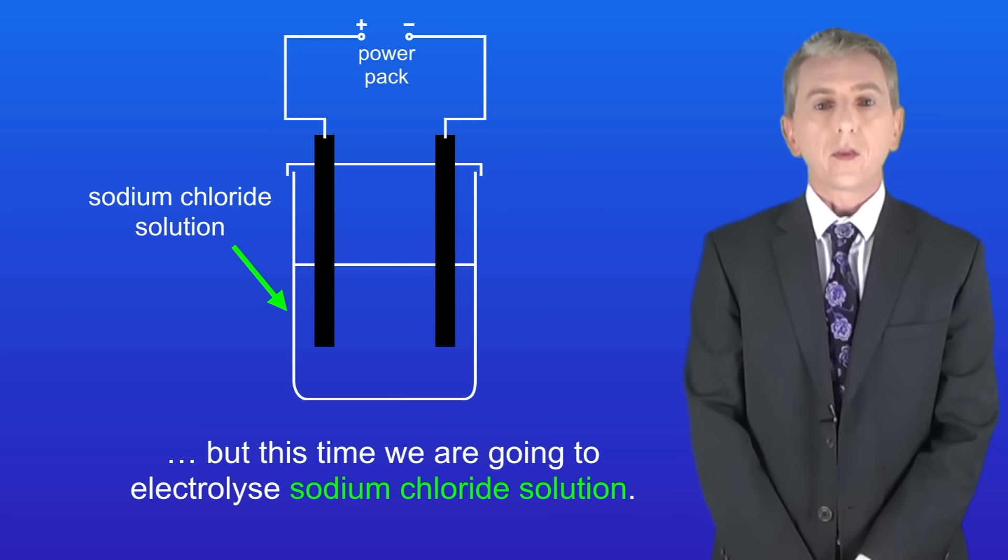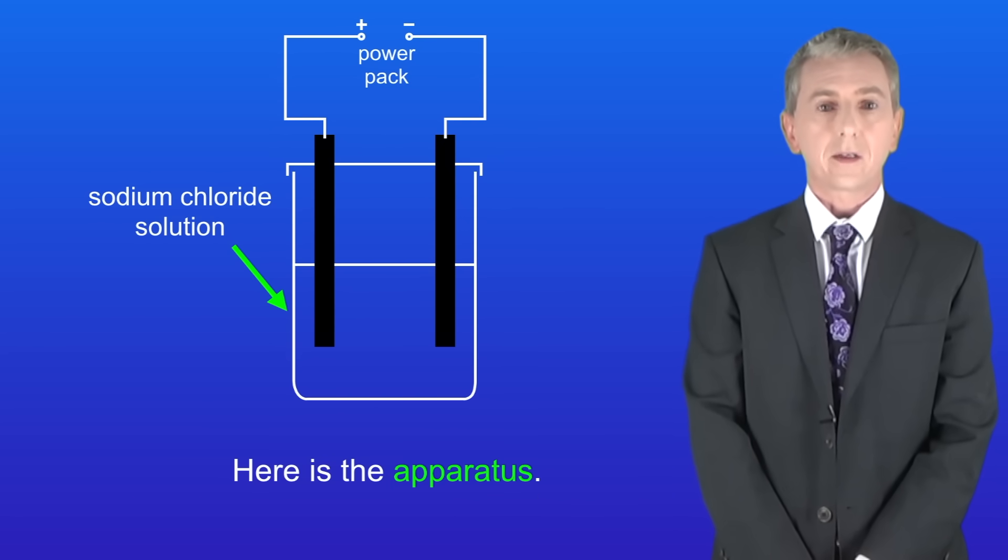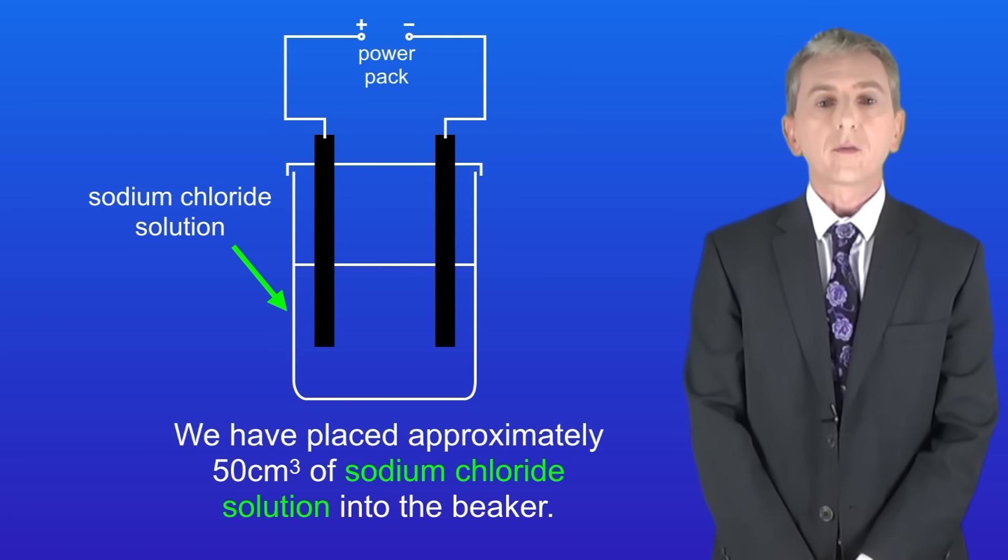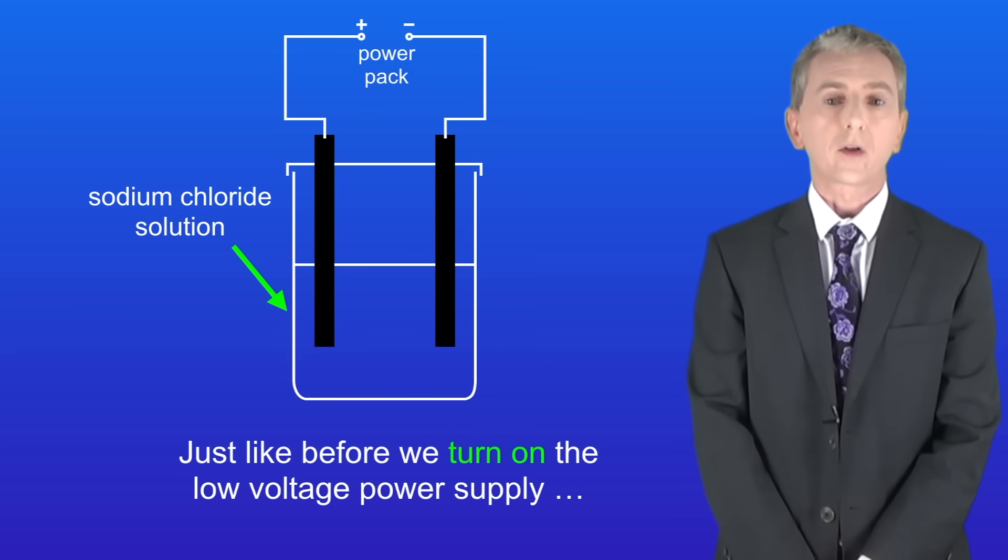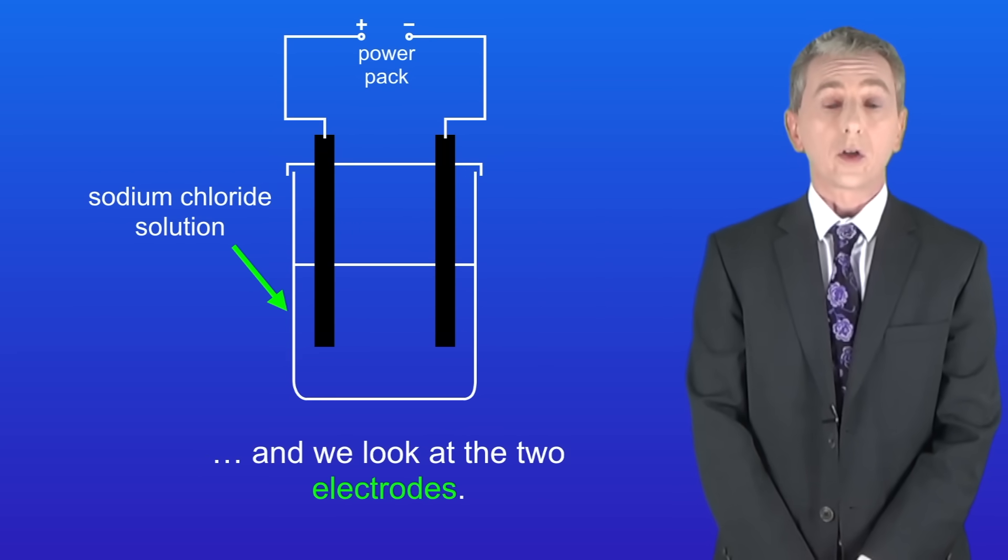Now we're going to repeat the experiment but this time we're going to electrolyze sodium chloride solution. We've placed approximately 50 centimeters cubed of sodium chloride solution into the beaker. Just like before we turn on the low voltage power supply and we look at the two electrodes.